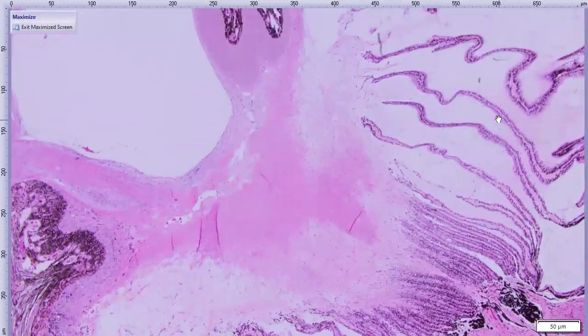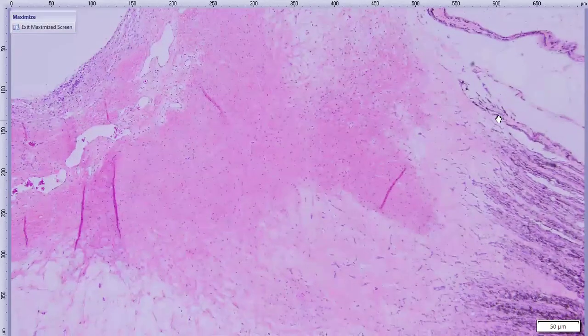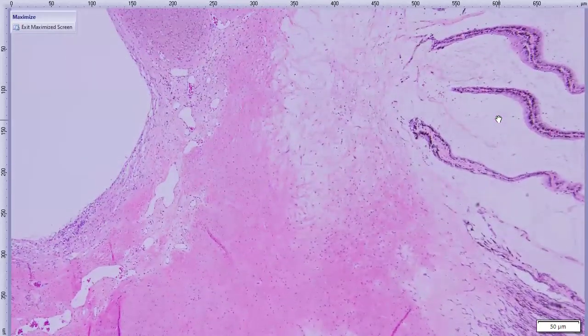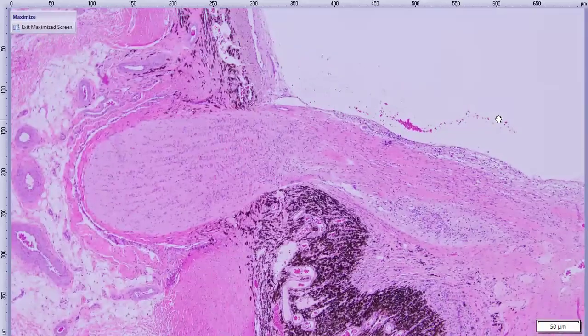We'll head into the posterior chamber. It turns out all that whitish tissue is intraocular fibrosis. And if we dive into that posterior chamber area, there really isn't any recognizable lens tissue in here at all. It's gone. And we have an optic nerve that is totally unconcerned. It doesn't know what's happening up front.